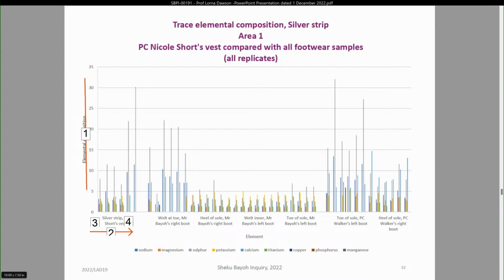I think you can see, hopefully, that if we focus on those last two replicates here, they are similar to these replicates here. But also, they are similar to some of the material here. Sorry, there. So this suggests that these also might have mixtures within those samples.